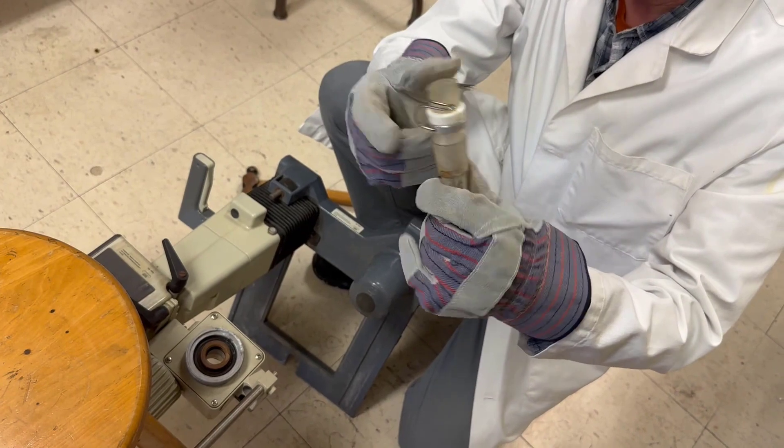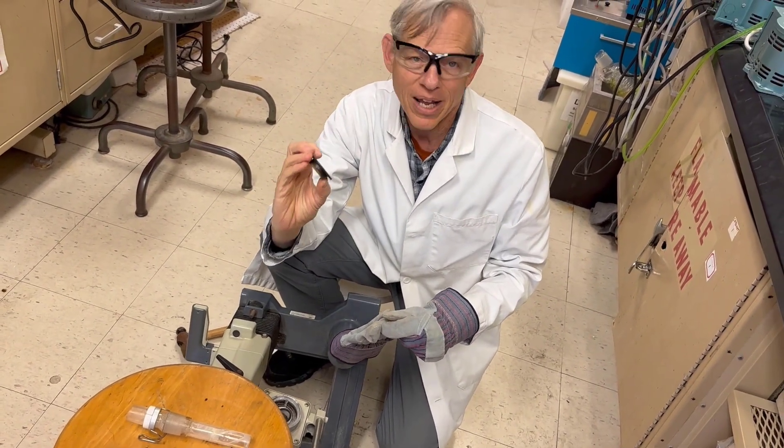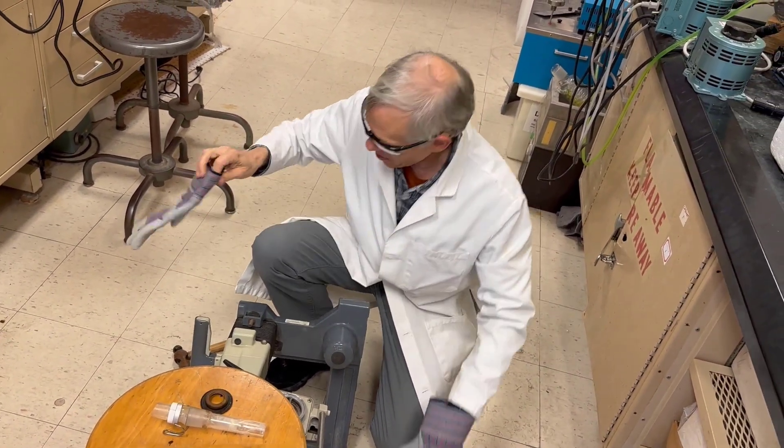Now you can go ahead and buy one of these and put a new one in, and it will be operational. You'll also want to replace the seal at the same time — buy a new seal and you'll be set.